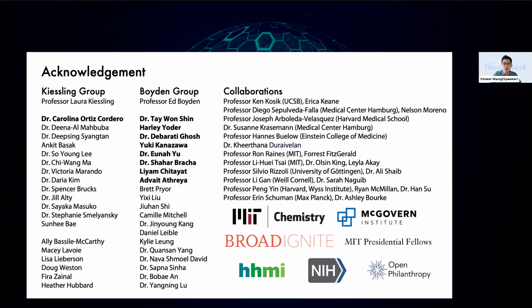I think there's a recent DNA expansion paper from the Boyden lab at Harvard. They actually have to generate a lot of the probes before expansion to circumvent this problem. In terms of labeling, I think it's definitely possible, but the difficulty will be to determine whether the DNA ultrastructure is preserved in the process of expansion.